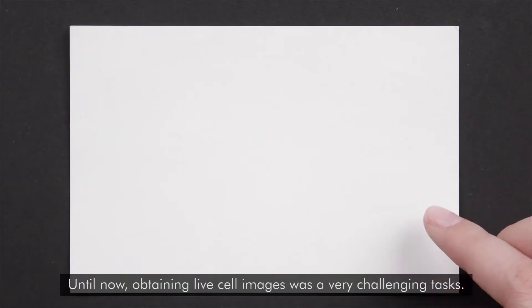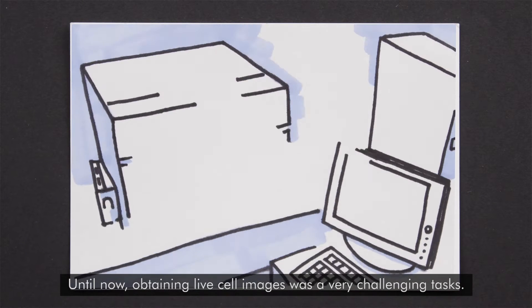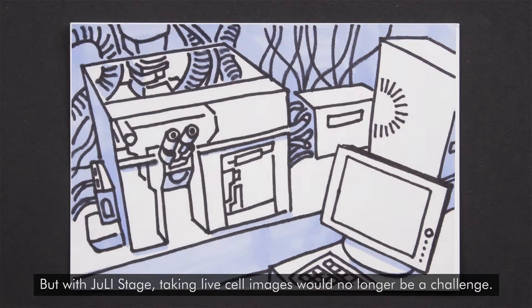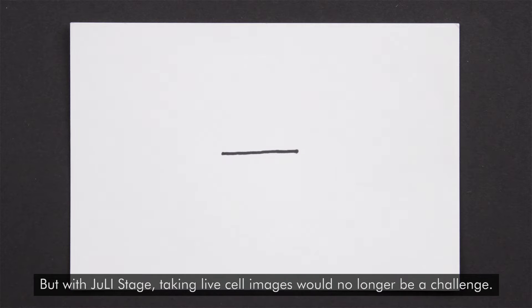Until now, obtaining live cell images was a very challenging task. The instruments were very expensive and the installments were very complicated and difficult. But with Julie Stage, taking live cell images would no longer be a challenge.